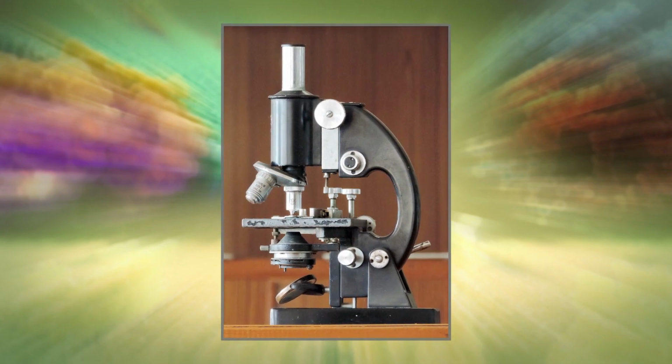The chemistry behind all dyes is acid-base reactions. Molecules such as nucleic acids have an affinity for basic dyes, and basic regions of the cell or some proteins have an affinity for acidic dyes. Vital staining refers to the uptake of dyes by cells.